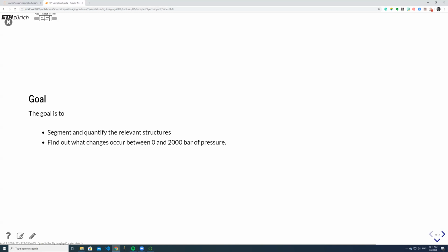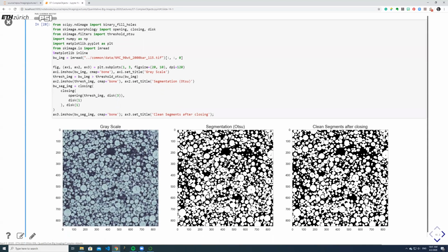That is more about the geometry. But the interesting thing is to look at what happens within the battery at different pressures and compare what the sample looks like if we have added some pressure to the sample. And it looks something like this.